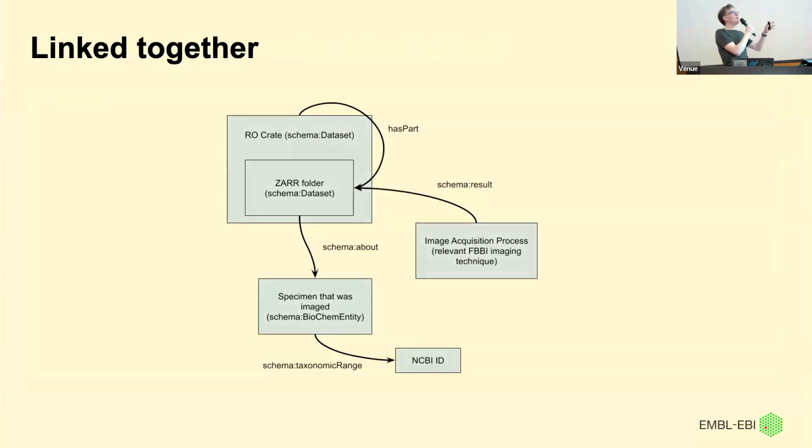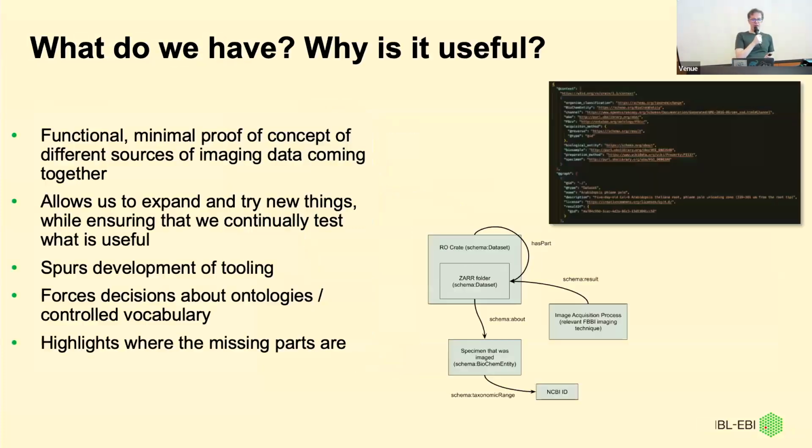And the other thing that's not visible directly by looking at the file, but you can visualize either using tools or by pen and paper and thinking about it, is that these things are linked together. So the file also describes how all of these conceptual ideas link together. This starts to put together all of the three pieces I was talking about in the introductory talk: the data model, the metadata, vocabularies, and how they're linked together. And again, it's super minimal, because that's all we thought we'd do at the time. There's something about the biology, there's something about the image acquisition process.